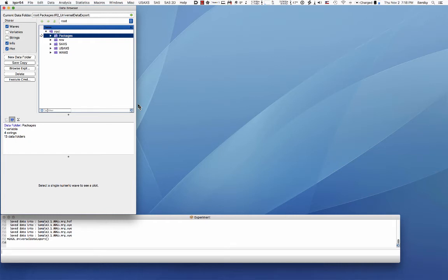Hello. This short movie should explain to you how to get data out of Igor, out of my packages, when they are generated in my packages, how to get them out so you can use them in other packages.